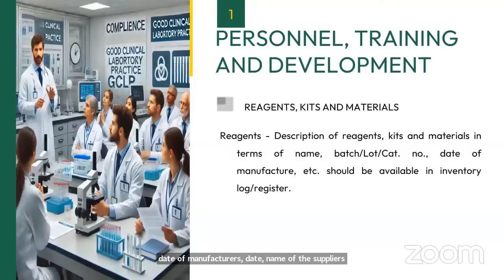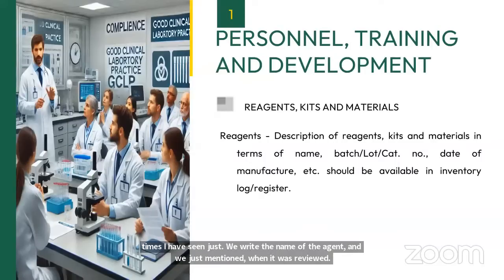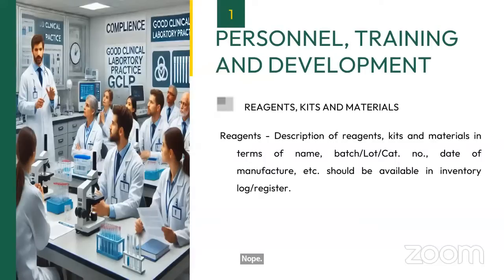So when we keep the record of the reagent, many times I have seen we just write the name of the reagent and mention when it was received. But apart from that, what is the purpose of that reagent? What is the material? What is the terms of that name? What is the batch number of that reagent? Lot number and catalog number also should be mentioned, and when it was manufactured and what the expiry date is. It should all be included in your inventory log or register.